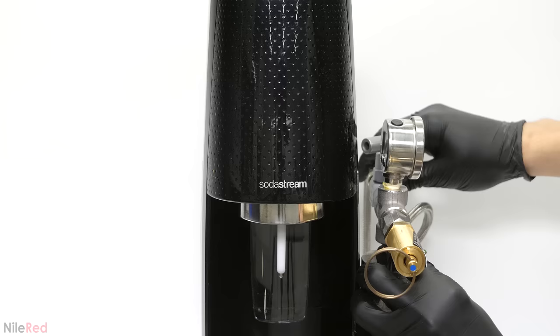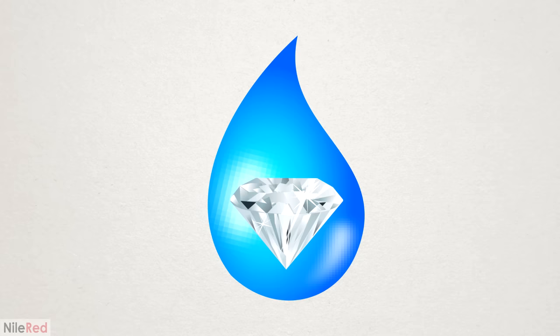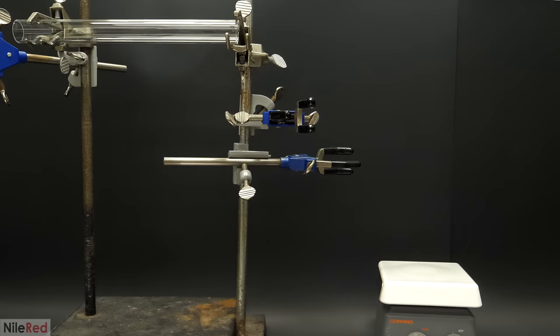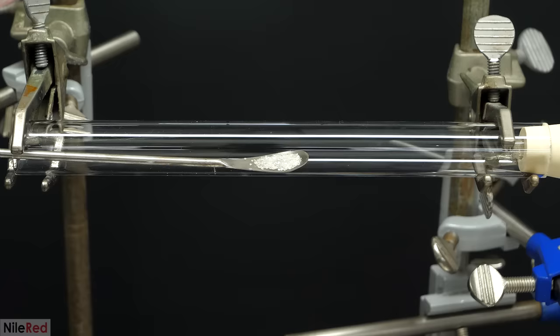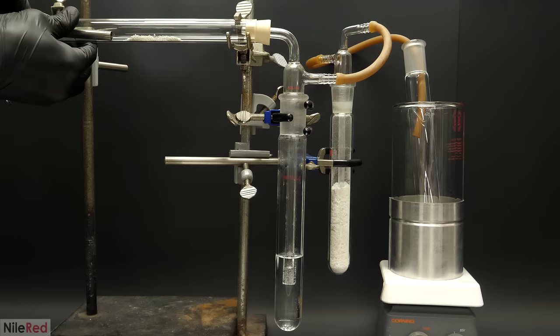I did a few quick tests to make sure the system wasn't leaking, and it all seemed good. For the burning setup, I started by adding the quartz tube, and this time I actually clamped it down instead of just balancing it. I then attached a bubbler with a small amount of water in it, which would wash all the CO2 gas that was made. This would probably add a bit of moisture though, so I followed it up with another bubbler filled with a drying salt. This was then fed directly into the test tube and the Dewar from before. After all my little tests I had about 3.5 grams of diamond left, and I decided to just use it all. I sealed the end with a stopper pre-fitted with the oxygen feed.